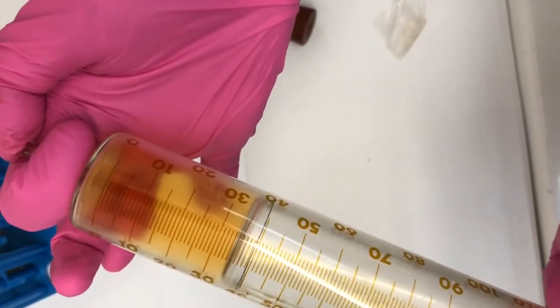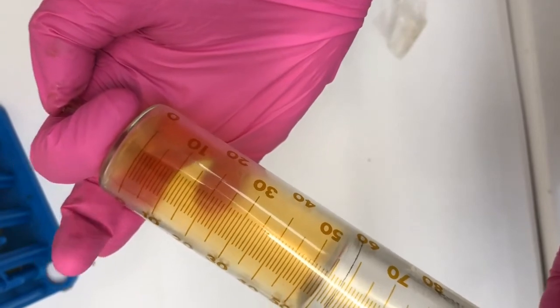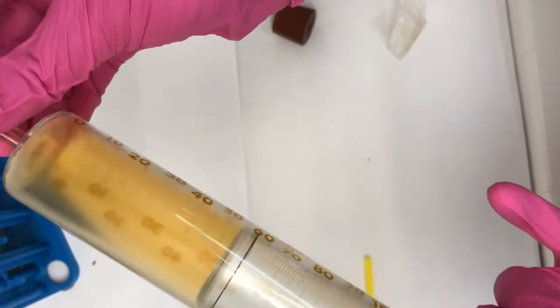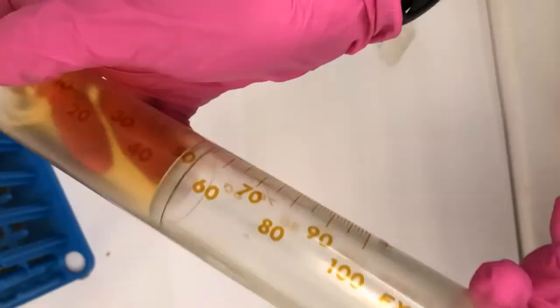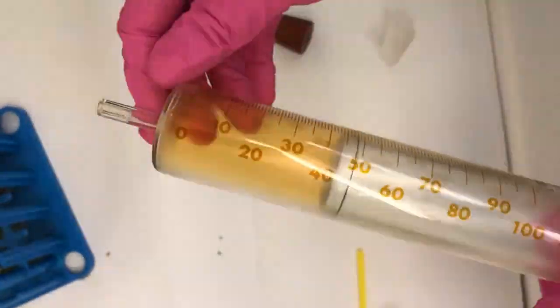So there was a bit of shuffling about as I looked down and tried to work out a way that I could hold the syringe without the pink of my glove coming through underneath. So when I push in the syringe, we are looking for a change in colour. So let's talk through this again. I push in my syringe, it immediately gets darker, but then it becomes paler again without me changing the volume.